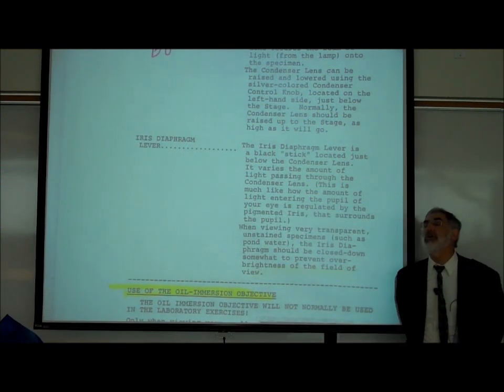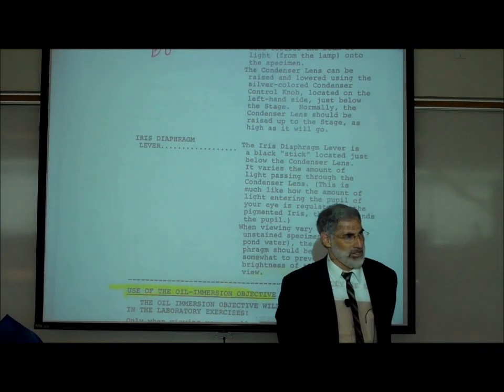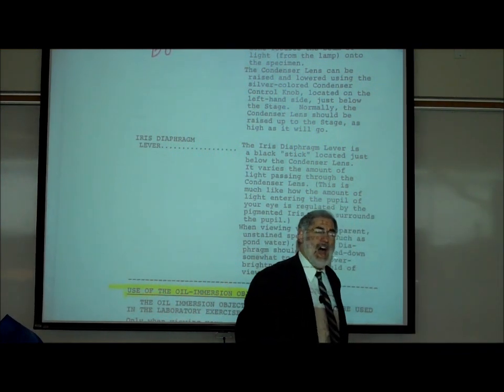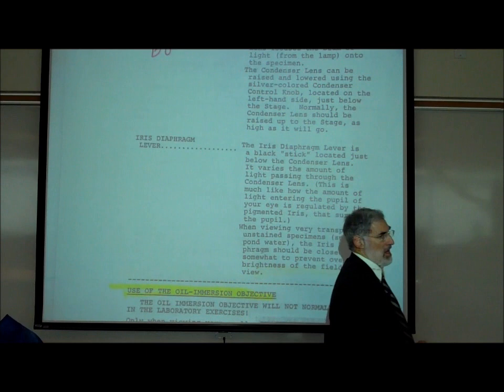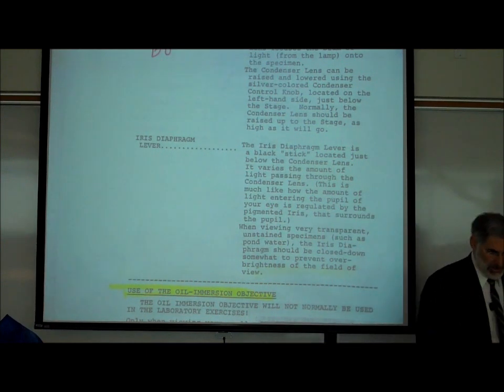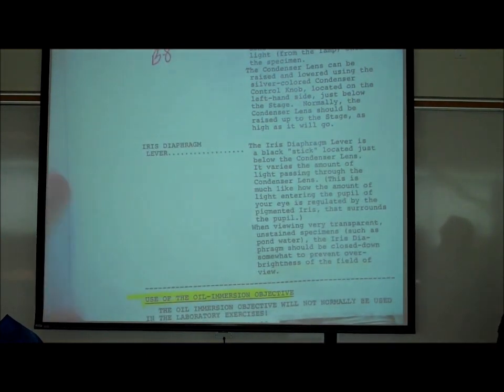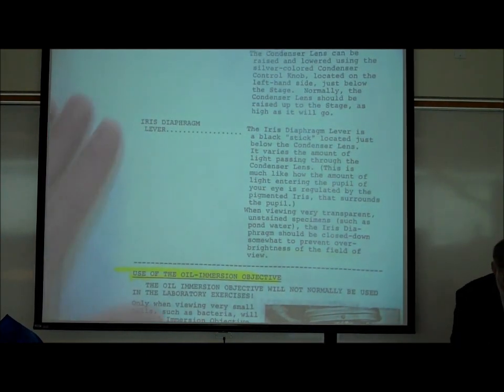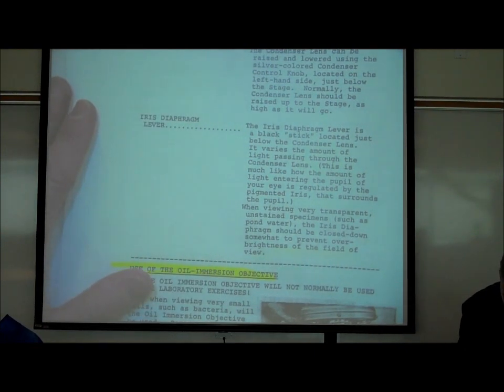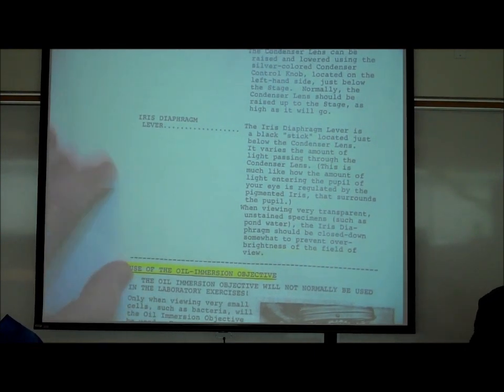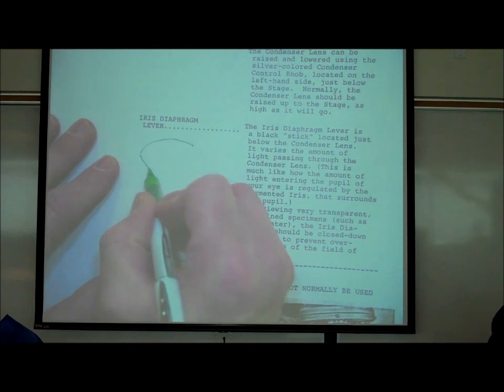The condenser lens focuses the beam of light on the specimen. The iris diaphragm lever changes how much light enters. It's named based on your own eye.